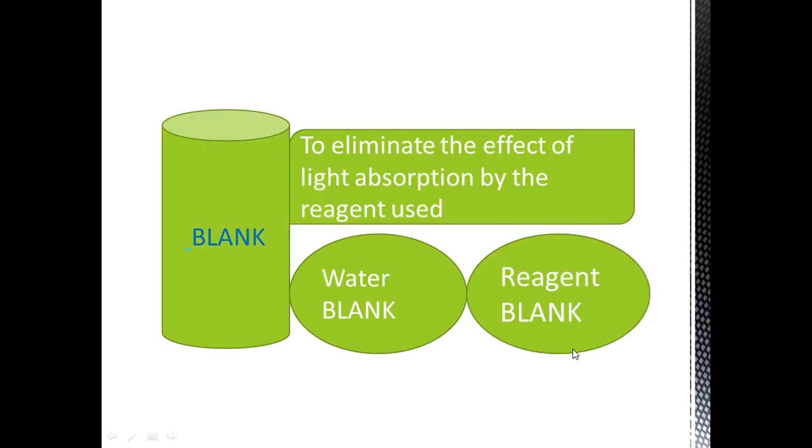The first one is the blank. It is used to eliminate the effect of light absorption by the reagents used. Mostly there are two blanks, a water blank as well as a reagent blank, and this particular blank value is subtracted from the test value.